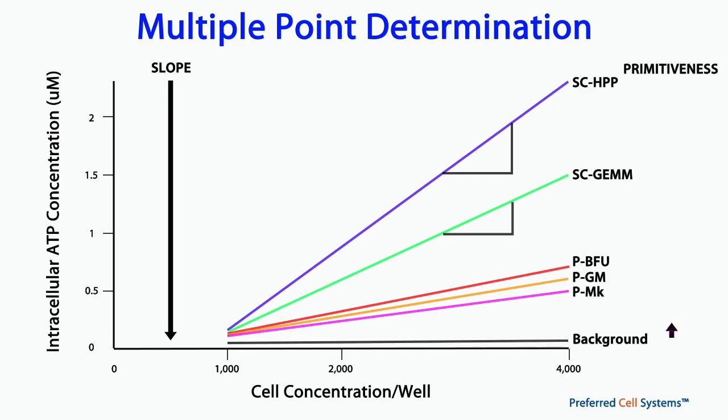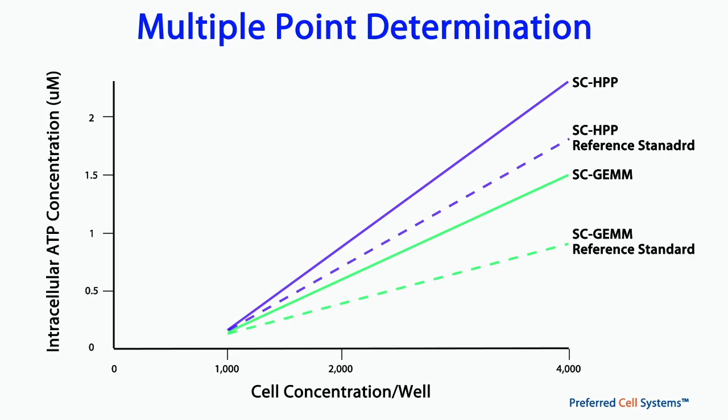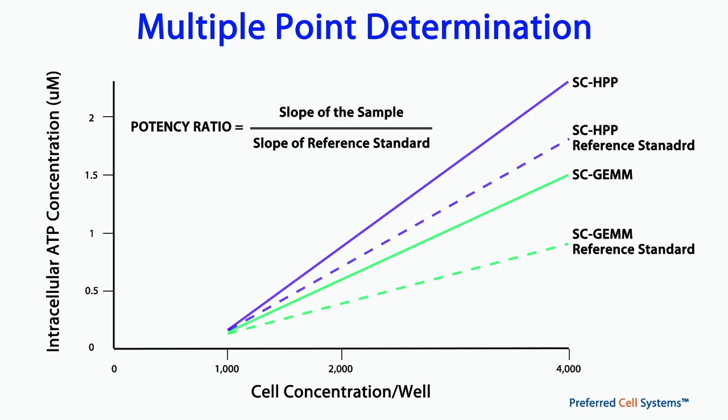In other words, the ATP response and slope of the 3-point cell dose response provides you with the ability to quantify both the degree of purity and primitiveness, and therefore the identity of the cells being detected in the assay. But this is not all the assay is telling you. The slope of the cell dose response also quantifies the proliferation potential or capacity of the cells being measured. When the slope of the sample is compared to the slope of the reference standard of the same material and purity, the potency ratio can be calculated. And this is the basis of any cell potency assay, and a stem cell potency assay in particular, which in this case is Halo SC-IPS.